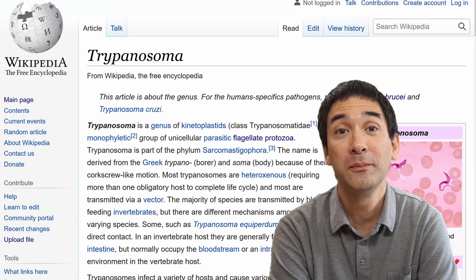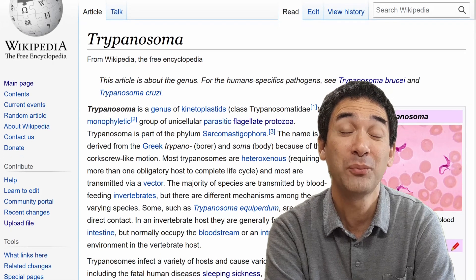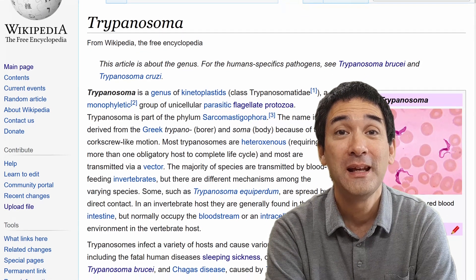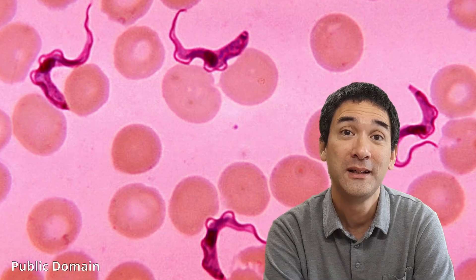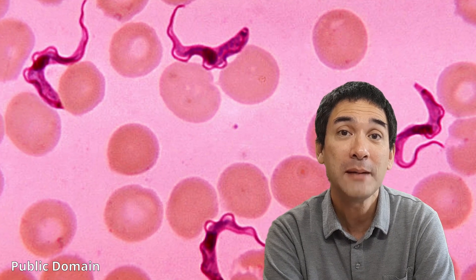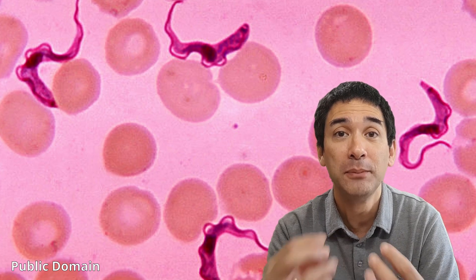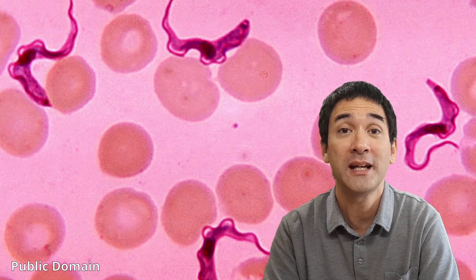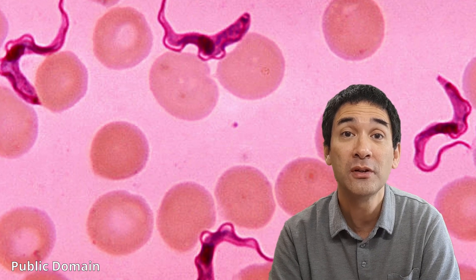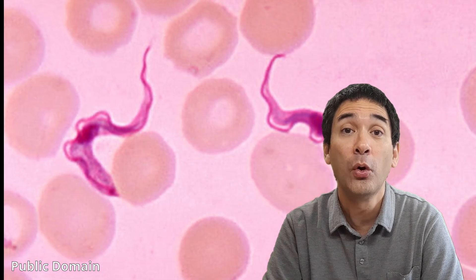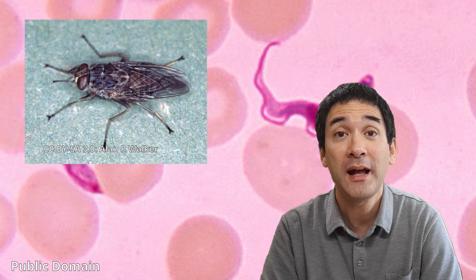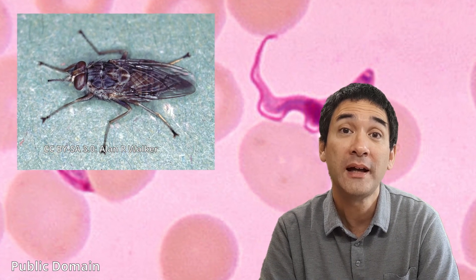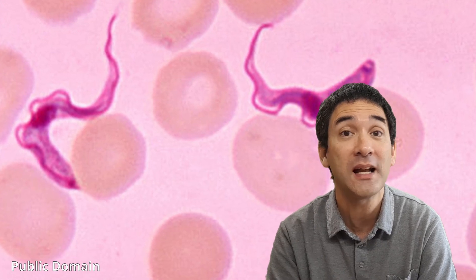I did a little bit of research, and there was lots of information available — it is not a disease that you want to get. These parasites are able to reproduce inside the blood of a human being and also in animals. They're spread from person to person or from animal to animal via flies — the so-called tsetse fly is responsible for this. Under the microscope you can actually quite easily identify and see them, and that's a way how you can diagnose it.